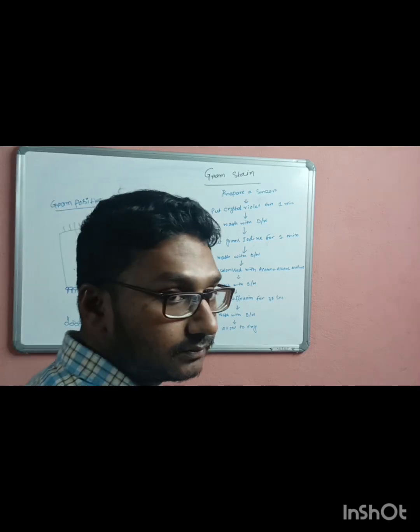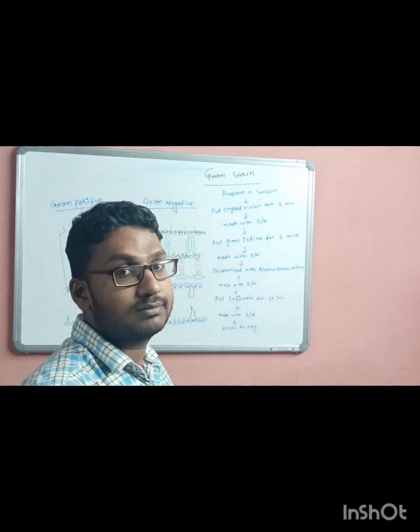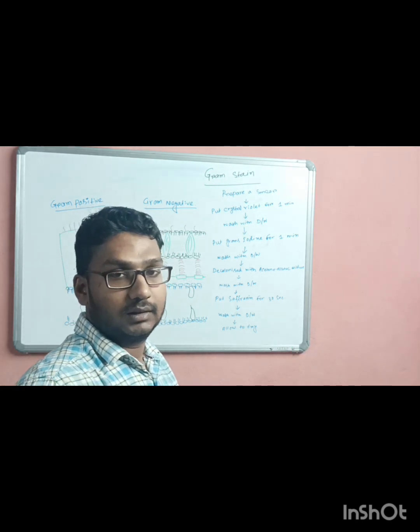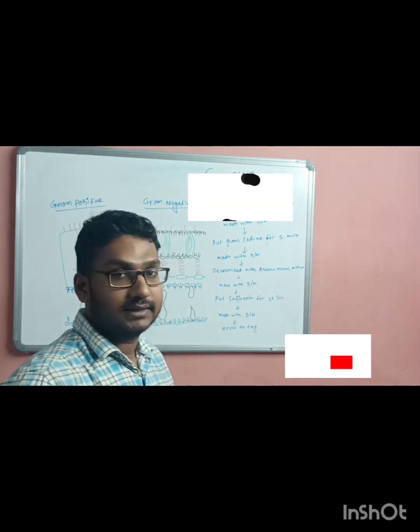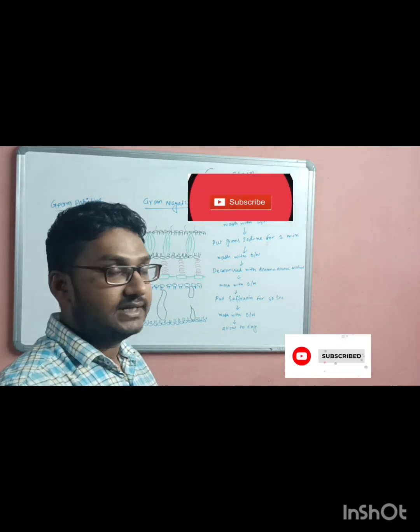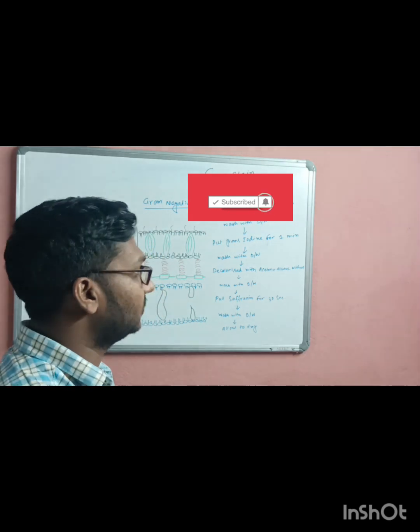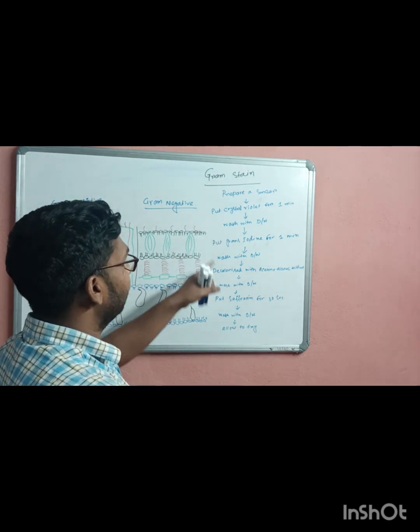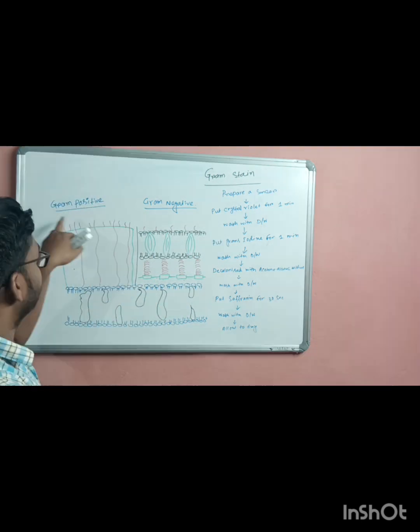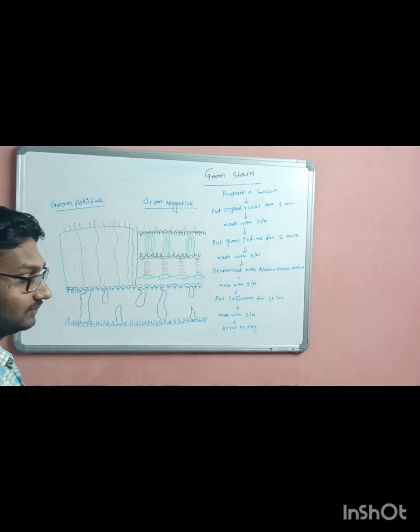Hello friends, today we will discuss the gram stain procedure. In my previous lecture, I already discussed the gram positive and gram negative bacterial cell wall and their composition. So today we again draw the picture: gram positive, and this one is the gram negative bacterial cell wall.